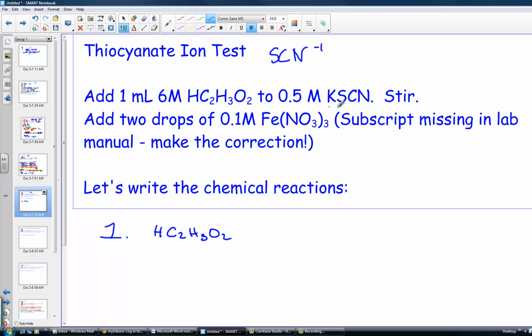And this here is your stock solution because this has the presence of thiocyanate. This is what you'll take to mix the 1:9 ratio. I need the dilution step.